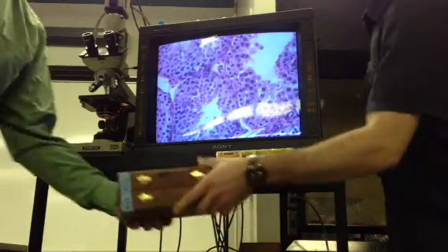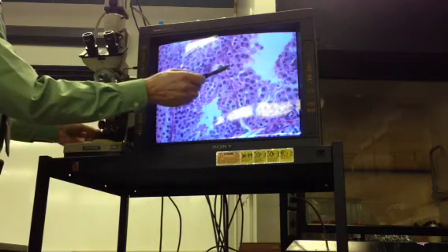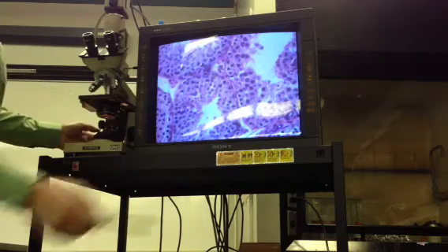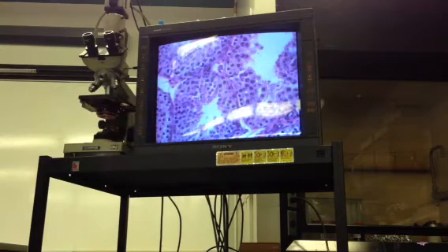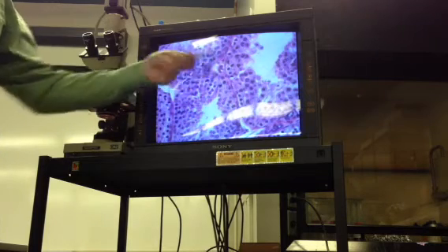So spermatogonia are only right beside the periphery. The spermatogonium has this very dark, very dense, tight little nucleus. The difference between that and a primary spermatocyte is you can see the chromosomes. It's a large cell where you can see the chromosomes, that's the primary. Secondary is kind of hard to differentiate from primary. You have to see them in context, and you usually don't see them together. So I wouldn't worry too much about a secondary spermatocyte. It's really spermatogonia, Sertoli cell nucleus, a primary spermatocyte, and mature sperm.